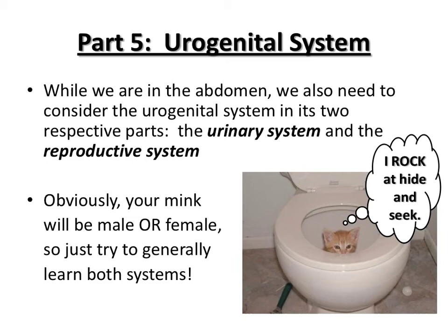I would encourage you, if one of the other groups in class has a different sex, so if your mink is male and theirs is female, maybe take a look at theirs at the end of dissection and check out what those female parts look like as well, or vice versa.